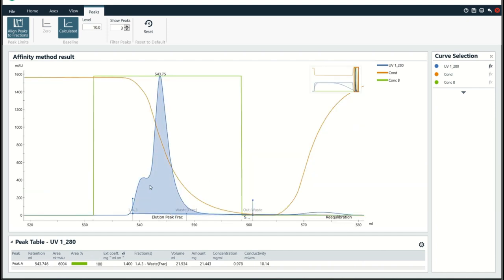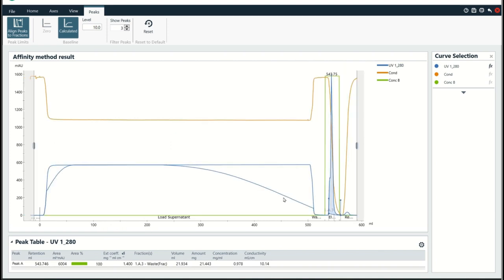We can see right here. This one has a pretty distinct shoulder. Sometimes that's because there's a different species here. Other times that's because of the way this curve is shaped. So it's hard to know that. And then I did type in the extinction coefficient already is 1.4, which means we ended up with a concentration of, it was one just a little while ago. It's probably because the baseline, let me zoom out. So the baseline here from the program's trying to draw a baseline for the sample loading. So I'll just move it over here. You'll notice how there's a little tiny bit at the bottom of the base of the illusion peak. There we go. That cleared it up.